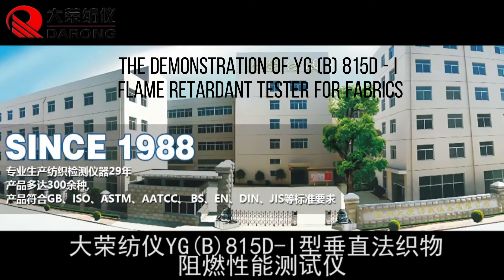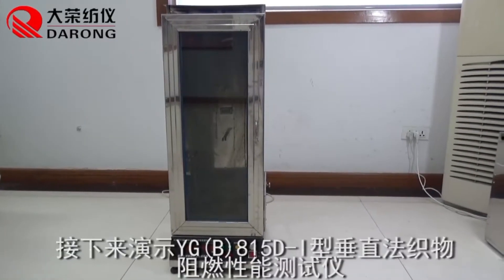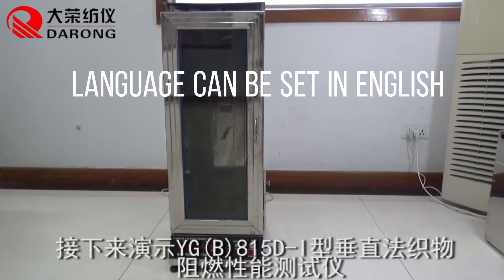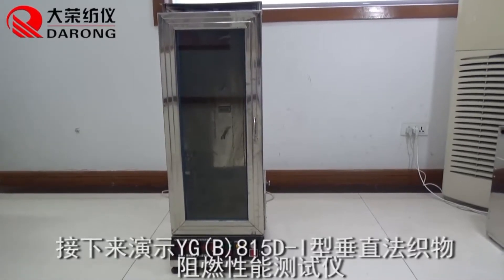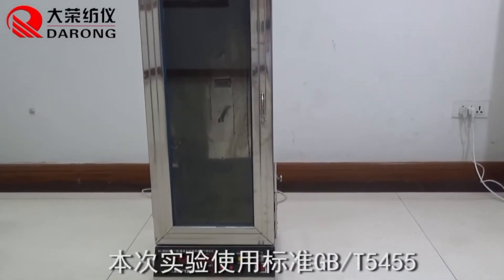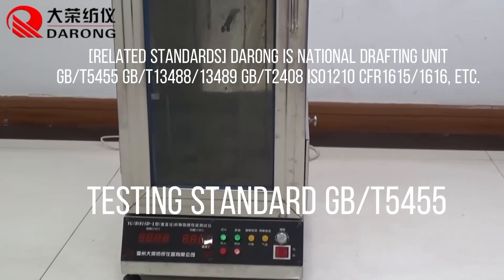The demonstration of YG (B) 815D-I flame retardant tester for fabrics. Language can be set in English. Testing standard GB/T5455.